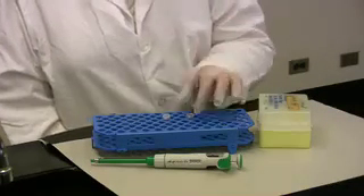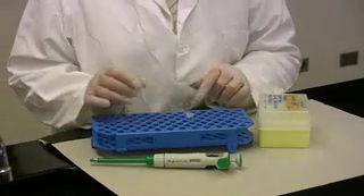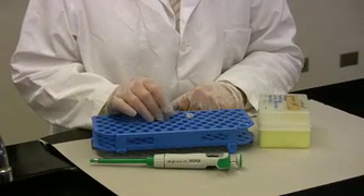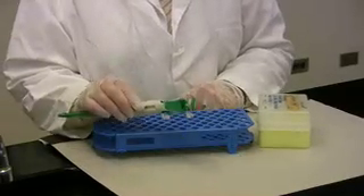Today, I wish to transfer 100 microliters of crystal violet into an empty Eppendorf tube. To do so, I have chosen a micropipetter that is a P200.